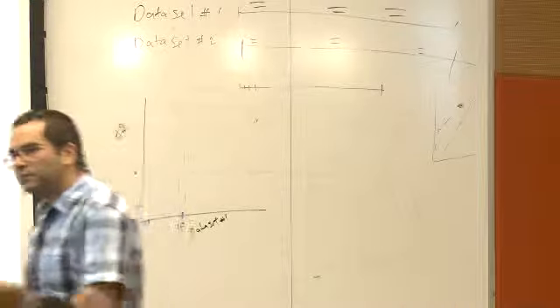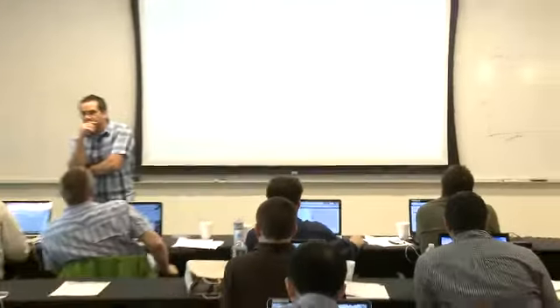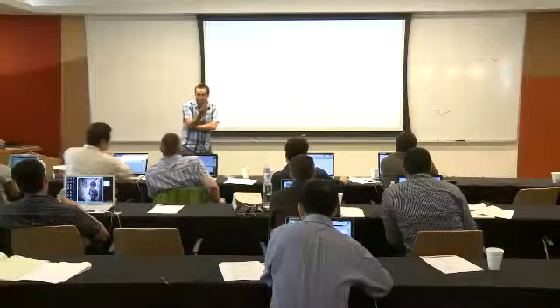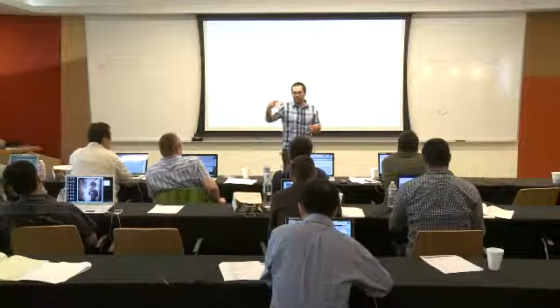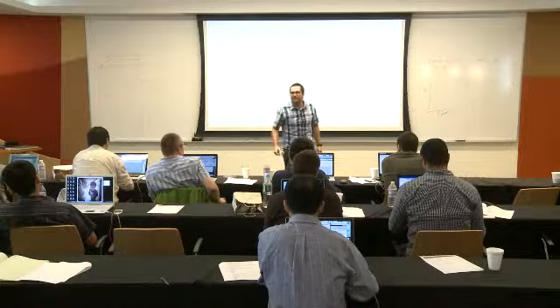Yes? My question was about the normalization, and when you're doing the bed format, the strand specificity is not important? It is important, not for this case, but for instance, for the TSS table, the one that we use is when we took into account the strand specificity, and then we know if a gene is going this way or that way. But we're trying to simplify it to the point that it's easiest. But yeah, it's a good point.